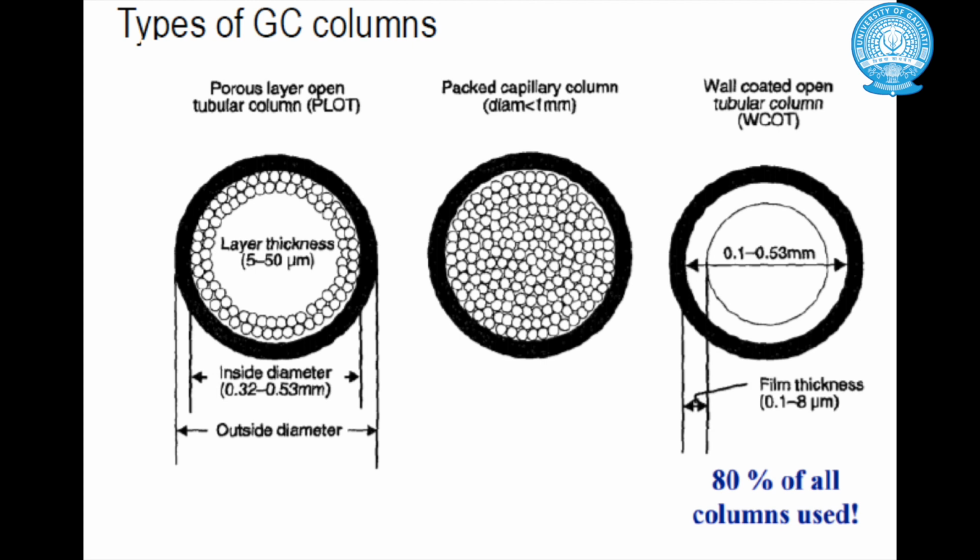Although gas chromatography has many applications, it too has demerits. For example, gas chromatography can detect only volatile compounds or those which can be evaporated intact at elevated temperatures, or from which volatile derivatives can be reliably obtained.